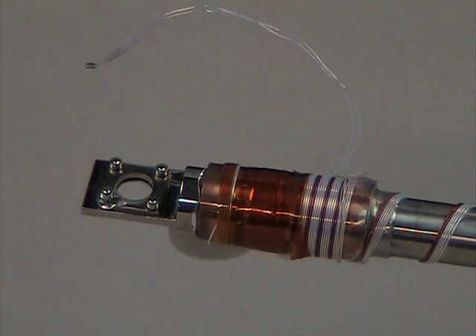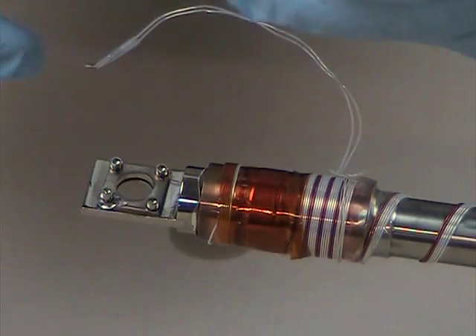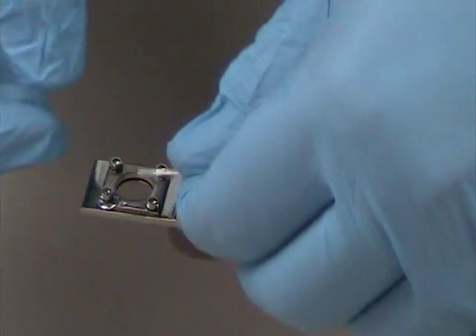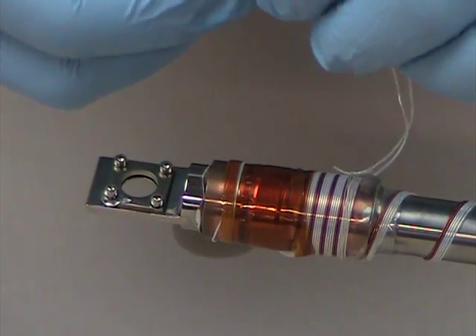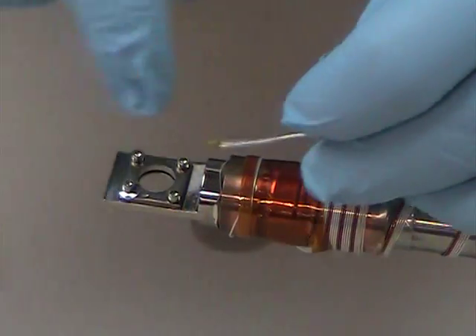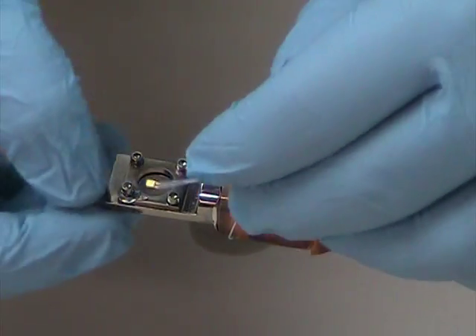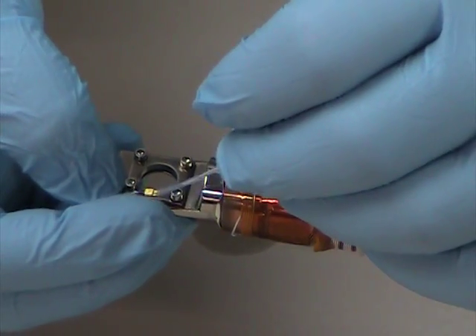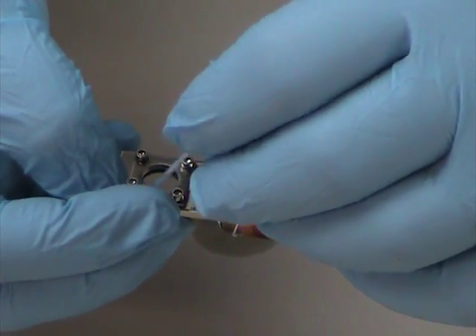Now I'm going to attach the sample sensor to the sample holder. I've already taken a tiny piece of indium for good thermal contact and placed it on the edge of the window mount here. Now I'm going to stick the sample sensor right on top of it.